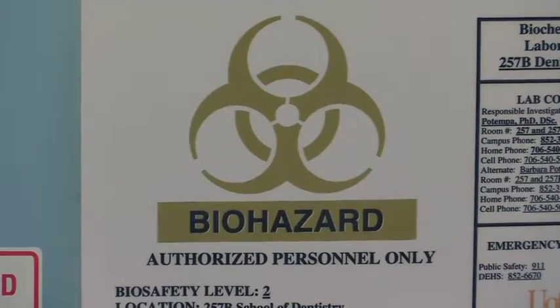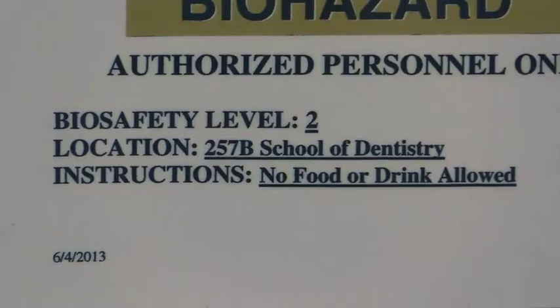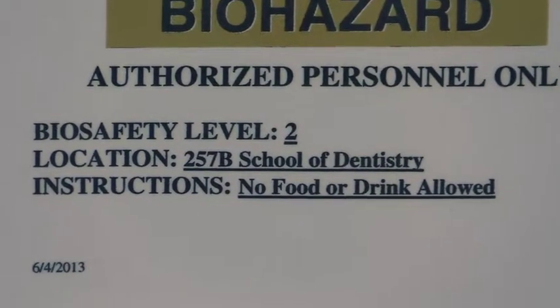What are they? Sure. Biosafety levels are a set of biocontainment precautions that are put in place to isolate potentially dangerous biohazards from escaping the lab environment. Okay, very good. What is the process that you go through to determine these levels? Well, we would start with a risk assessment.